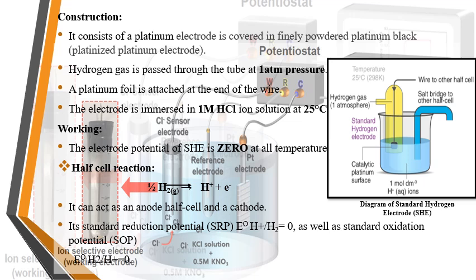And it provides a stable reference potential. As we say, it's a reference electrode anyway, so the reference potential has to be standard and stable, in one position, which is 0.00 volt for the electrochemical measurement. The construction ensures the electrode stability and reproducibility, making it a crucial tool for determining electrode potential and calibrating other electrodes.